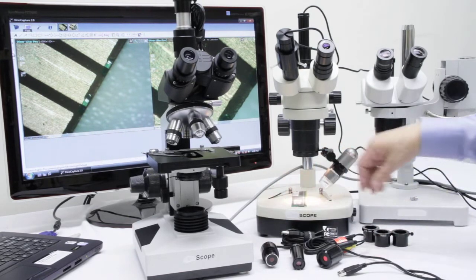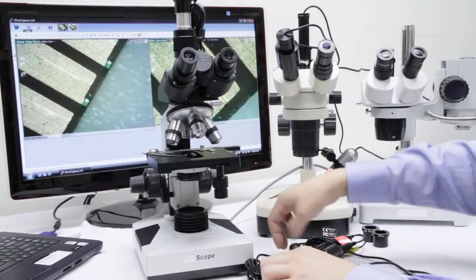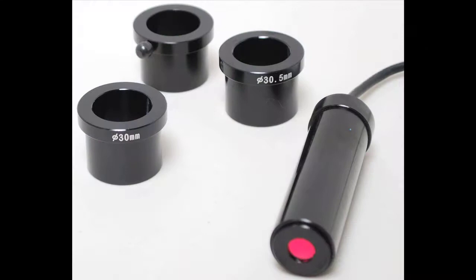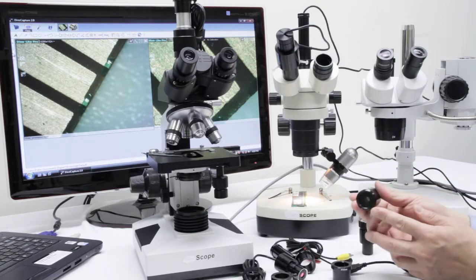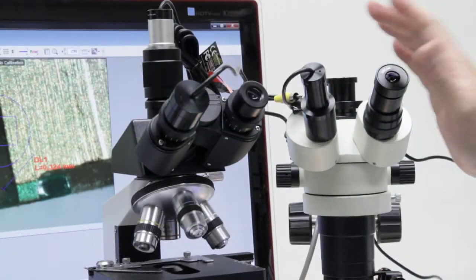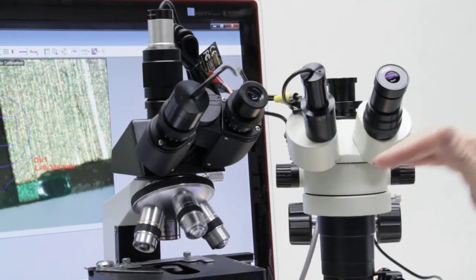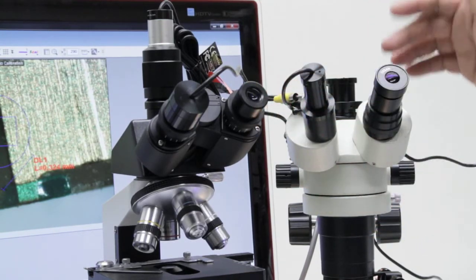There are 1.3 megapixel cameras and a 5 megapixel model. Certain models come with 30 millimeter, 30.5 millimeter, and/or C-mount adapters. The AM423C is the standard C-mount or trinocular size. Traditional microscopes usually have 23 millimeter, 30 millimeter, or 30.5 millimeter eyepieces.